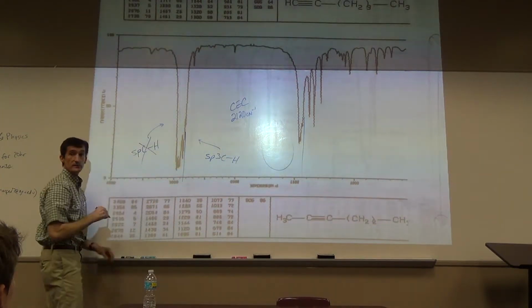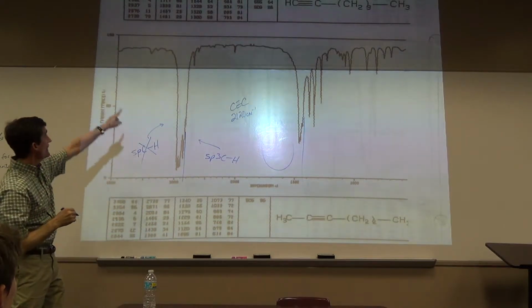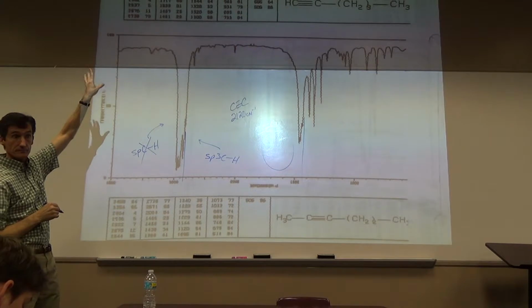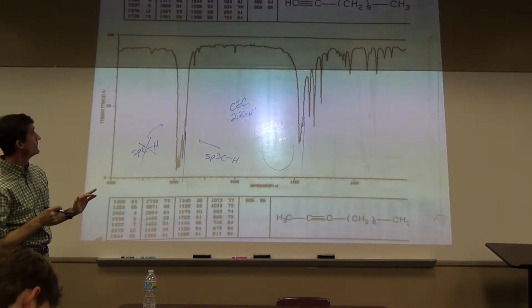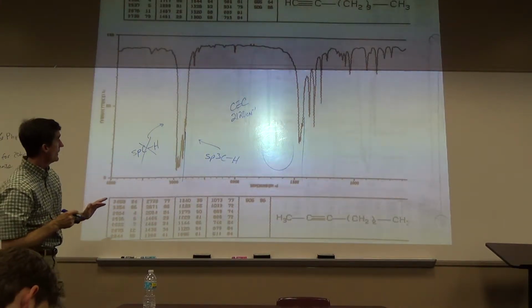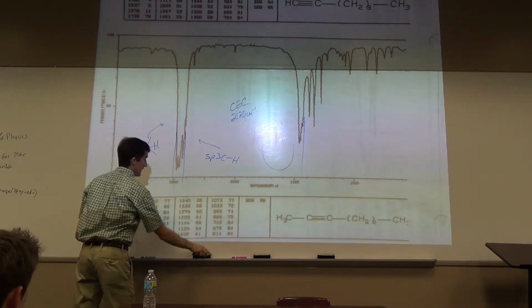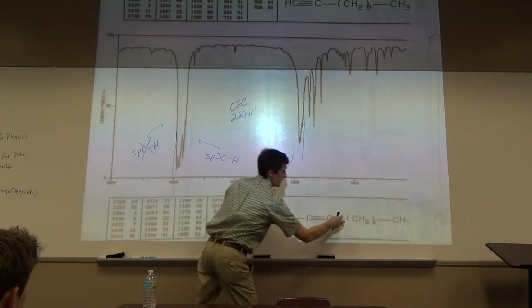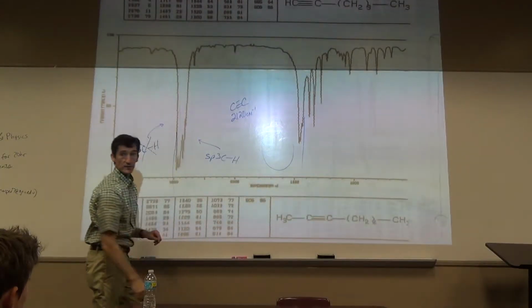So there's no sp CH. We do have a little blip up there. It certainly doesn't look like the peak above. And then we have the same old sp3ch, but there's plenty of that through there, and this guy here on the end.